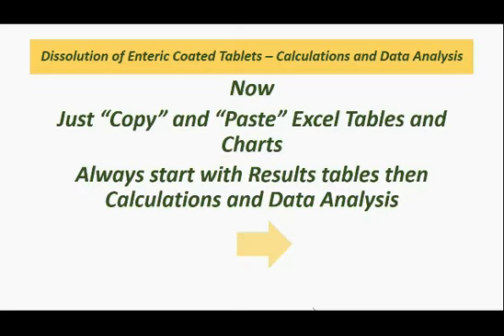Then just copy and paste Excel tables and charts. Always start with the results tables, the raw results tables, then calculations and data analysis.